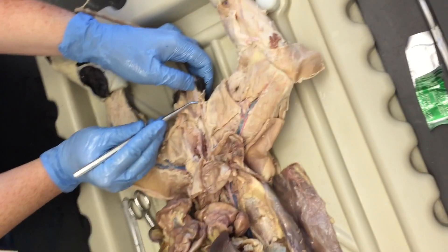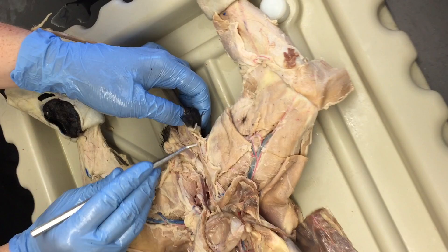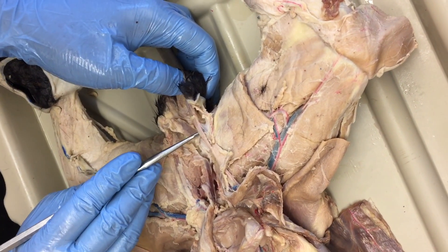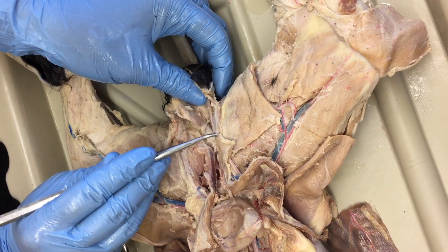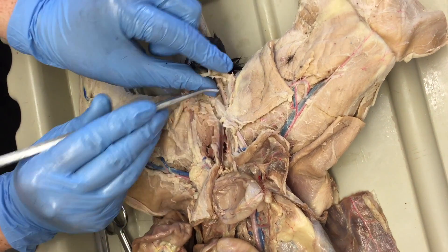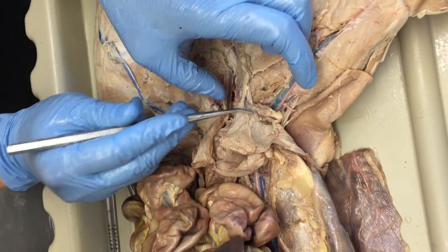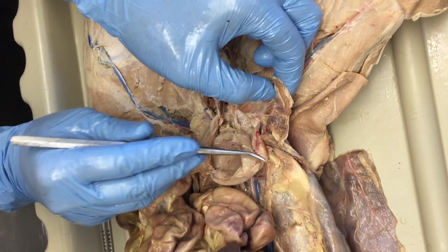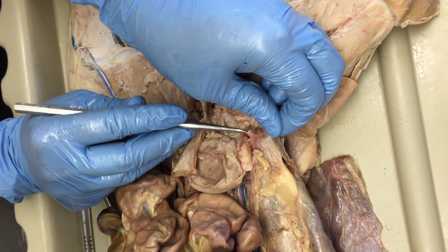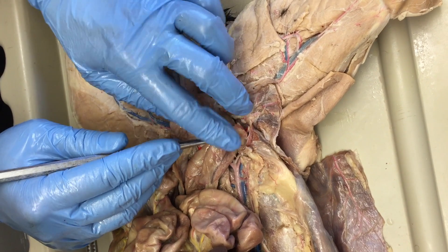Coming out from the testis is the spermatic cord, which consists of the ductus deferens, the spermatic artery, and the spermatic vein. It's only called the spermatic cord when all three of those are present. It shoots along here and then enters into the body somewhere over here but comes out over here. There's your spermatic artery and spermatic vein.